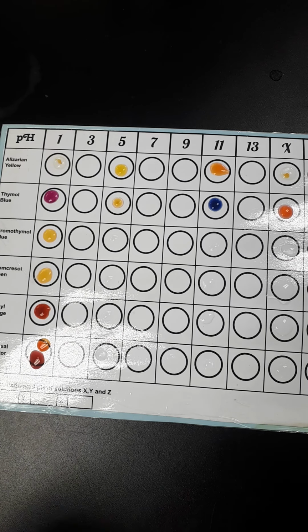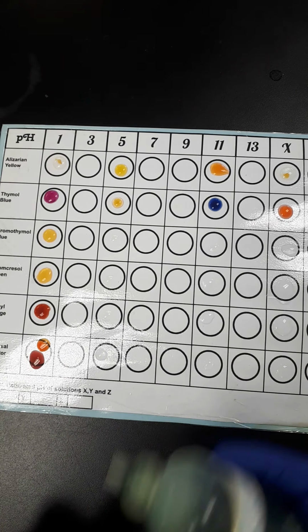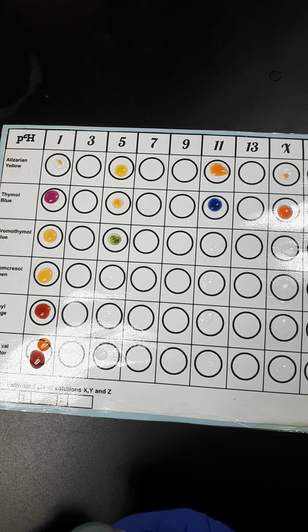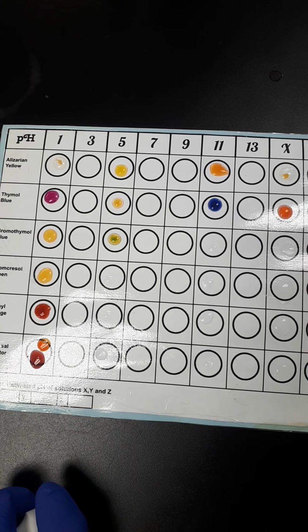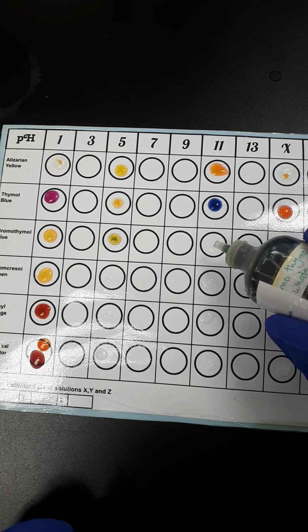Cool. Okay, next one. Let's see, bromothymol blue. I think I've got that right here. Let's try it out in a pH of 5. A pH of 5 turns overall, I'd say, mostly yellow. Yeah, mostly yellow. There's a tiny bit of green left over in there. That might just be because we haven't used very much of it.